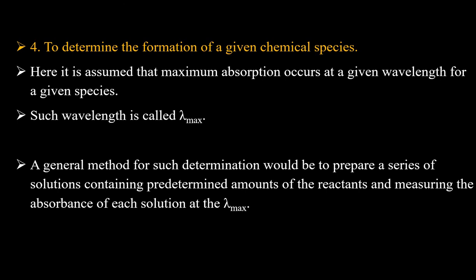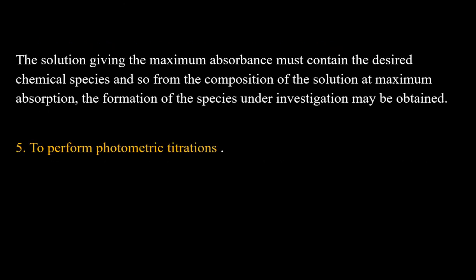The solution giving maximum absorption must contain the desired chemical species, and so from the composition of the solution at maximum absorption, the formula of the species under investigation may be obtained.